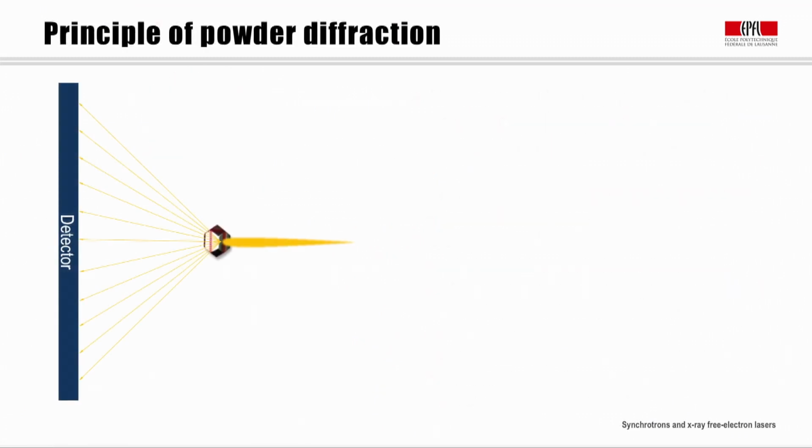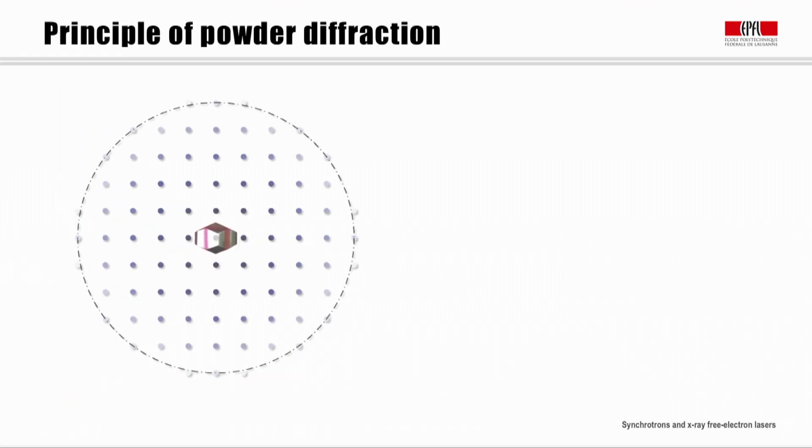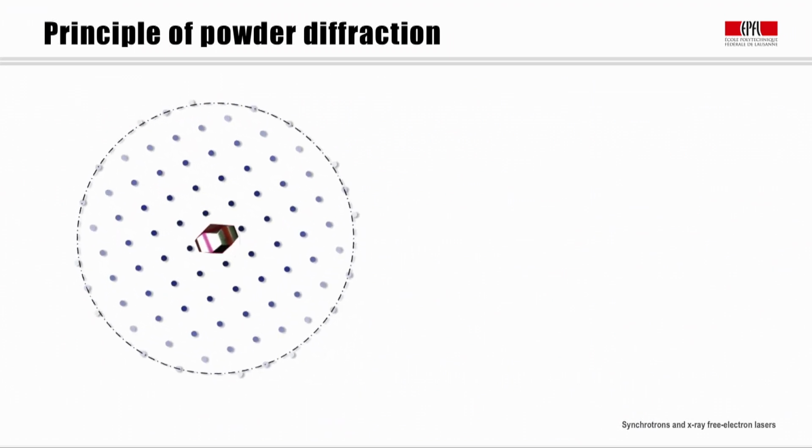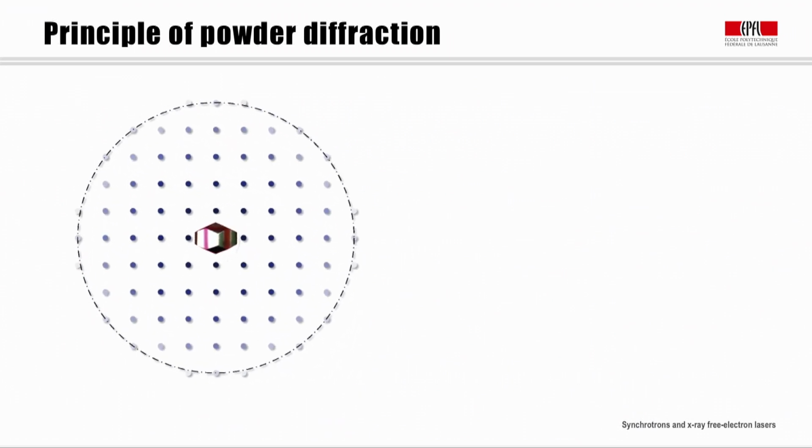Let's consider how powder diffraction data is generated. So let's consider first a single crystal which contains a set of angularly separated Bragg maxima in reciprocal space. Let's look at this setup from the perspective of the incident beam. It should not be a surprise that if we rotate the crystal around the incident beam's axis, the diffraction pattern will rotate in exactly the same manner. It would be very surprising if this was not the case.